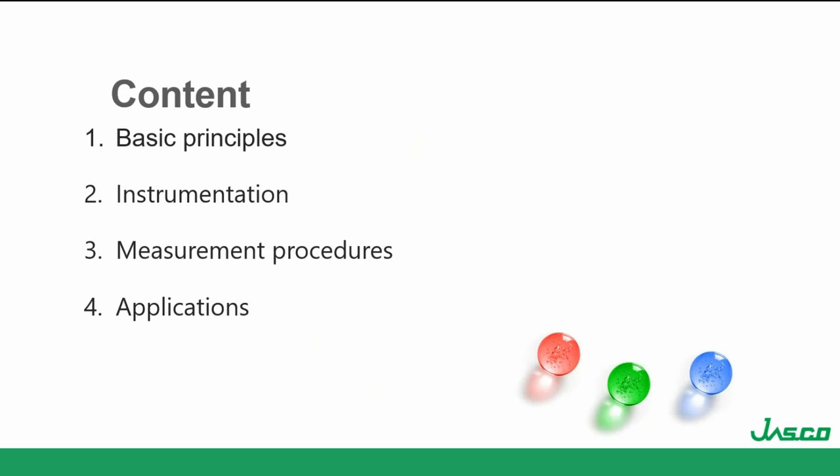So some of the topics that I'm going to be talking about today are the basics and principles. Of course, I would like to show what JASCO offers regarding VCD instrumentation. I'm going to review some measurement procedures, some of those parameters that are really important to acquire very good data, and show you some applications that maybe you can find useful.